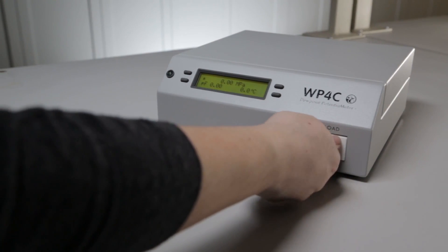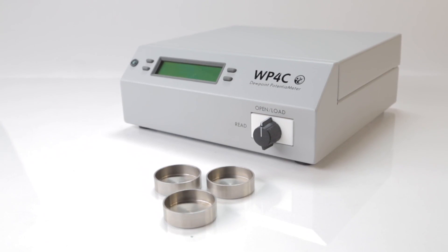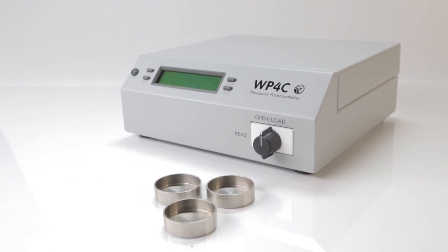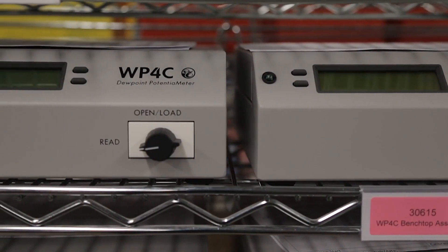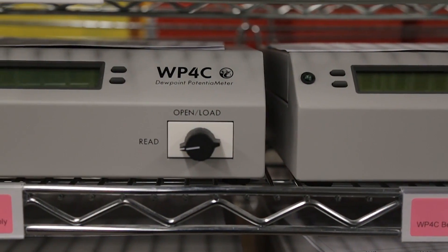We were determined to make the WP4C capable of accurate water potential measurements in this zone, but pushing its functional range up was a huge challenge. To get that measurement, we needed to measure temperature to within a thousandth of a degree. Improvements in components and an overhaul of the electronic sensor system delivered better temperature resolution, and one of our research scientists discovered a way to linearize the calibration so with a simple offset correction, we can dial in accuracy to better than plus or minus 50 kPa.